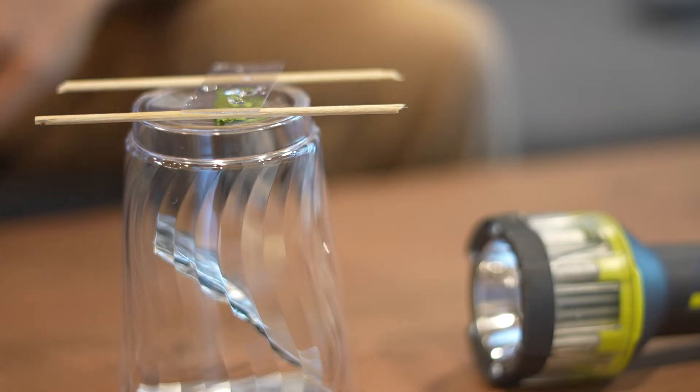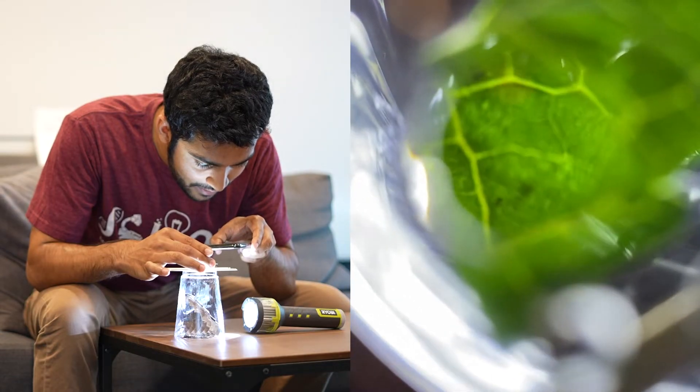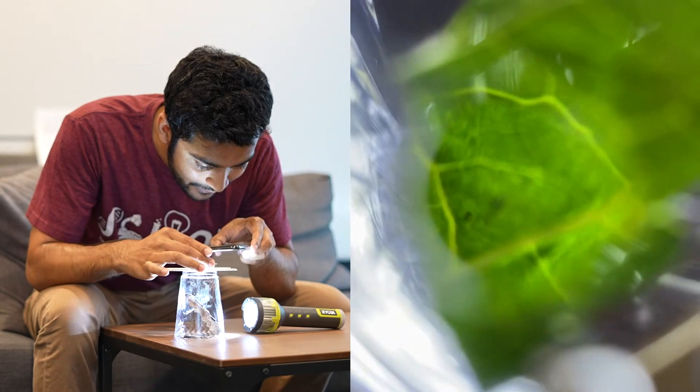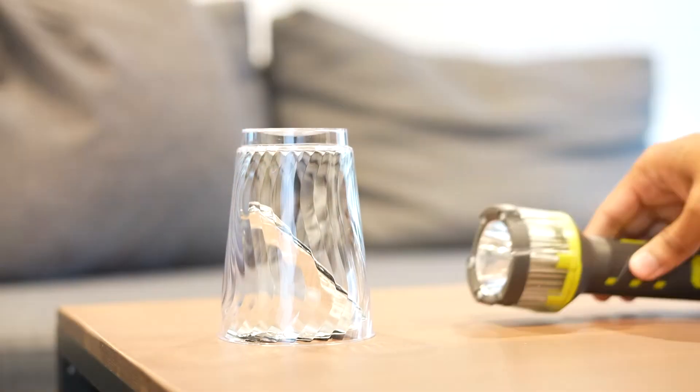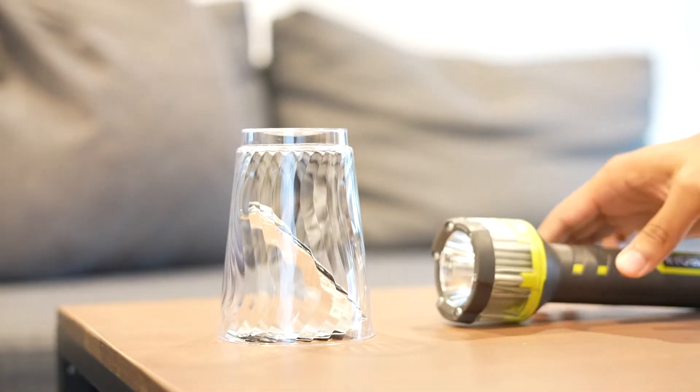Then, figure out a way to hold it above your sample, and you've got yourself a microscope. Whoa. I added this plastic cup aluminum foil flashlight combination to shine light through my sample.